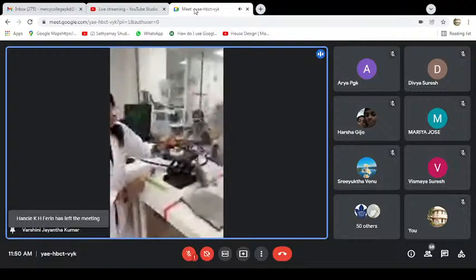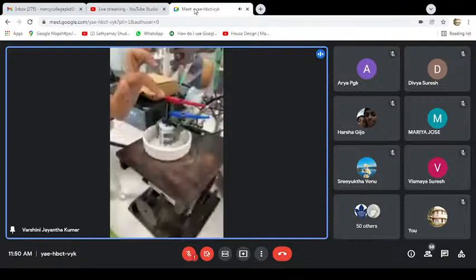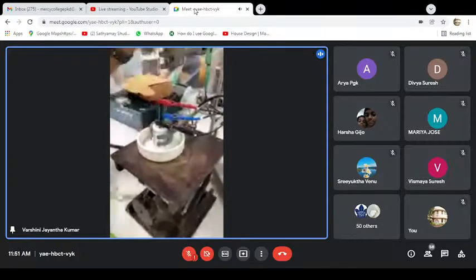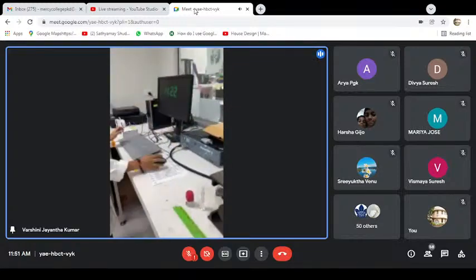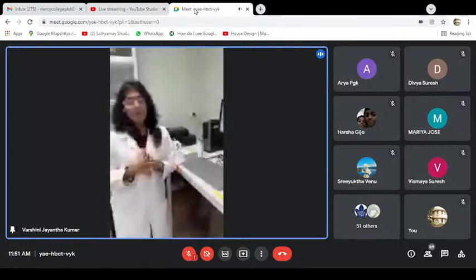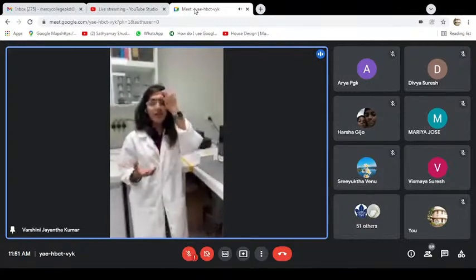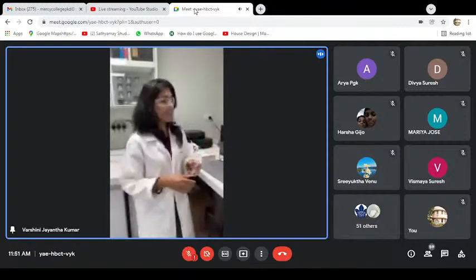So if you come closer, this is a small cuvette which has electrolyte solution in there, which is connected with 3 electrodes. This is the working electrode, counter, and reference electrode. These electrodes are connected through a potentiostat which is kept here and attached to the software. So let's run one cyclic voltammogram of ferrocene, which is like the basic compound. I'm pretty sure that most of the master's students might be learning cyclic voltammetry in, I guess, the 3rd semester. So you will be able to see how we do that.